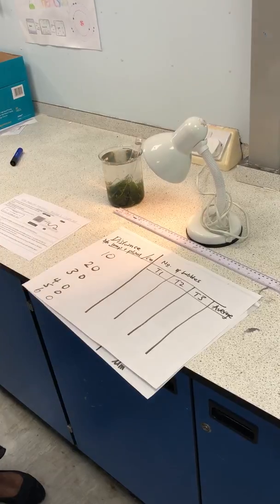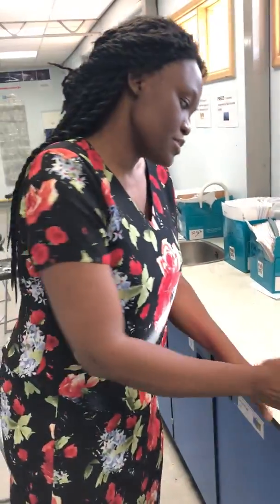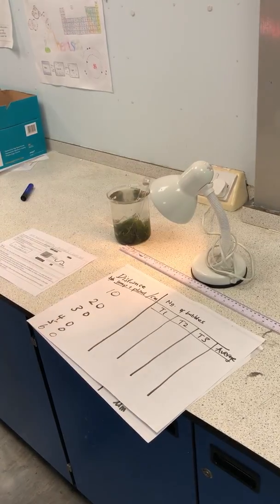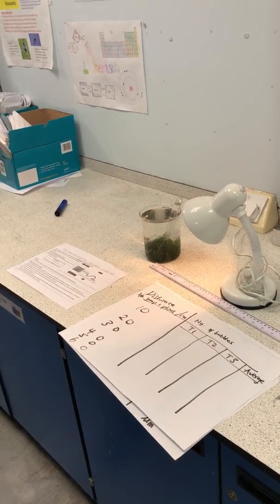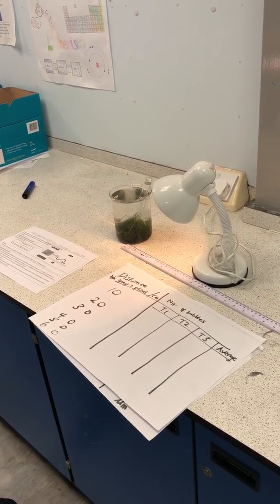If we look at the average and it's giving us an increase, we can say that as we increase the distance, this is what is happening. But really, from our prediction, we should expect to see that the further the lamp is from the pondweed, the fewer the bubbles you'll be getting. Why? Because the light intensity reduces as you increase the distance.